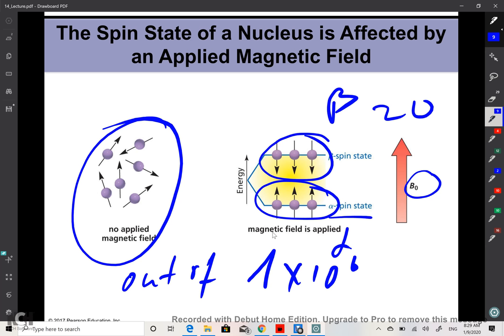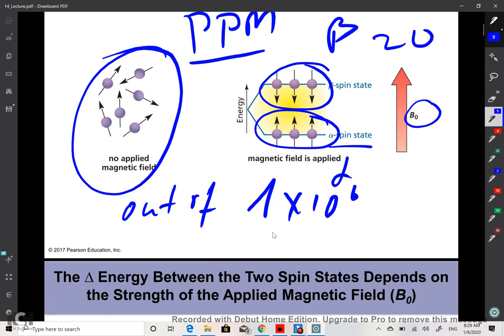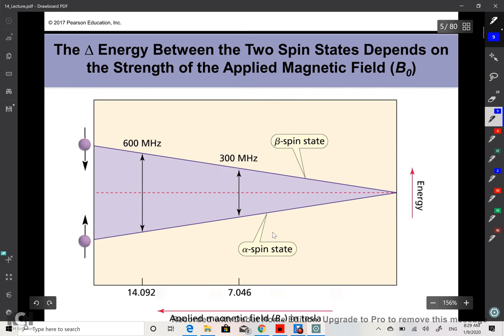And that's why the unit for measuring NMR is parts per million. We call that the ppm. That's the unit. We'll get to that. That comes from here, meaning that you can only measure a very, very tiny amount. That's what we refer to as parts per million. Okay. Does that make sense with the principle so far? We haven't gotten in there yet. We're still talking about that.